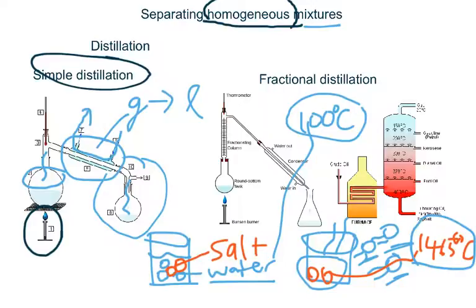And remember, this is cold water, so that we can actually cool down the gas and turn it into a liquid and condense it. So that's what a condenser is. Now let's talk about fractional distillation.